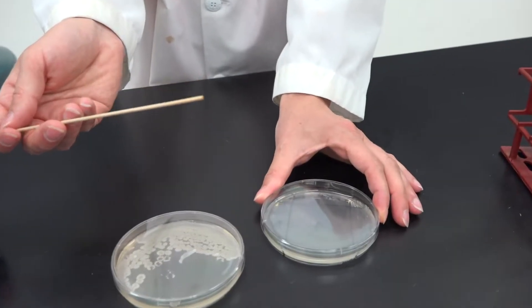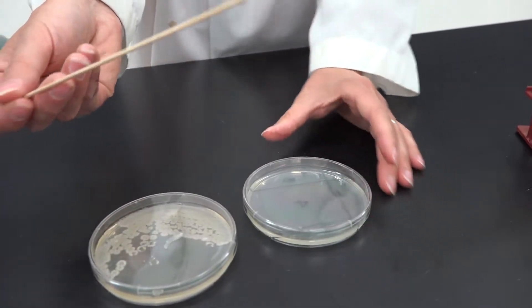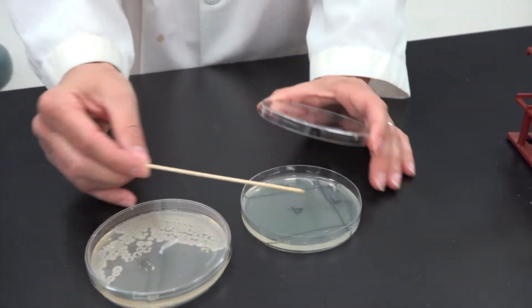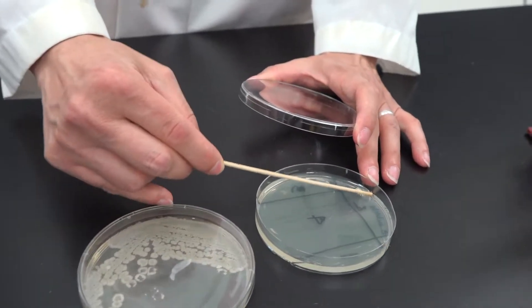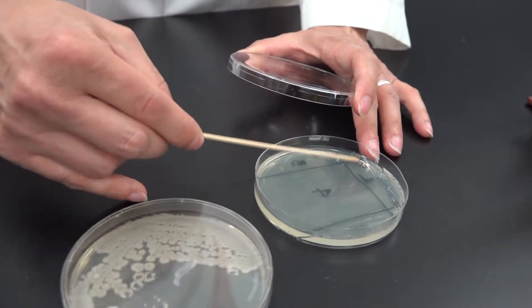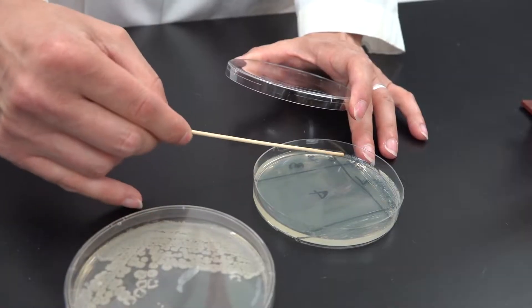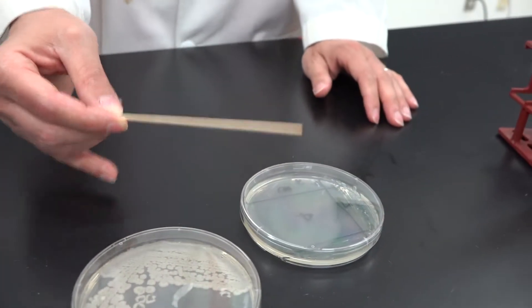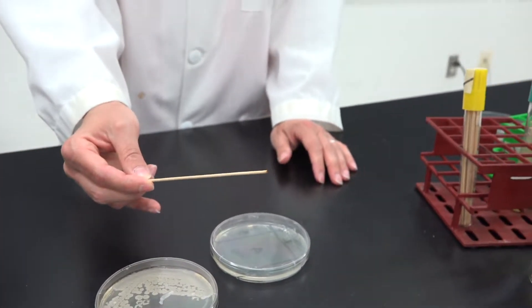Without touching any new bacteria, turn the plate 90 degrees. Take the stick, touch the bacteria at the corner of quadrant one, and spread them evenly across quadrant two. Then discard that stick.